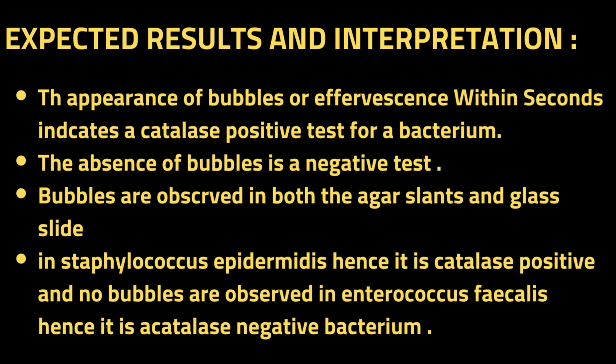Expected results and interpretation. The appearance of bubbles or effervescence within seconds indicates a catalase positive test for a bacterium. The absence of bubbles is a negative test. Bubbles are observed in both the agar slants and glass slide in Staphylococcus epidermidis, hence it is catalase positive. And no bubbles are observed in Enterococcus faecalis, hence it is a catalase negative bacterium.